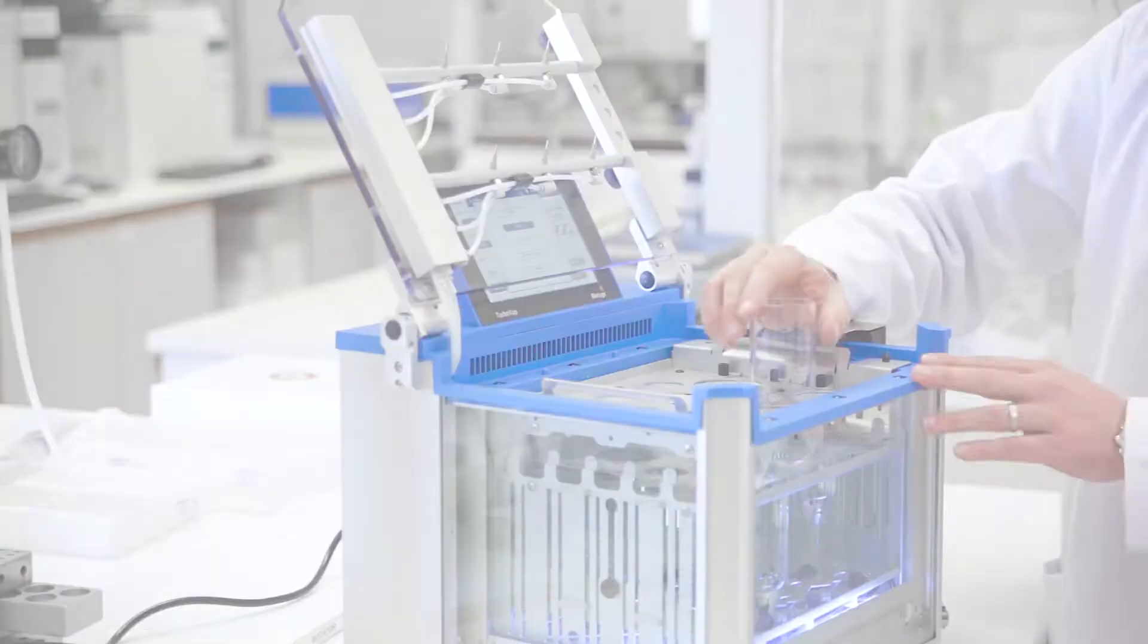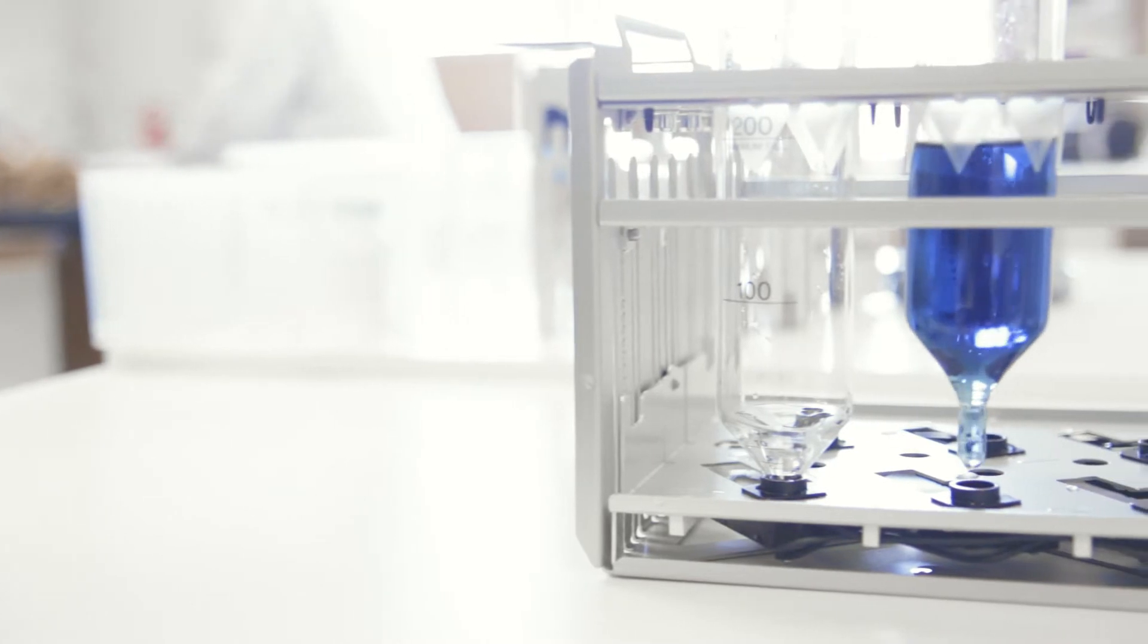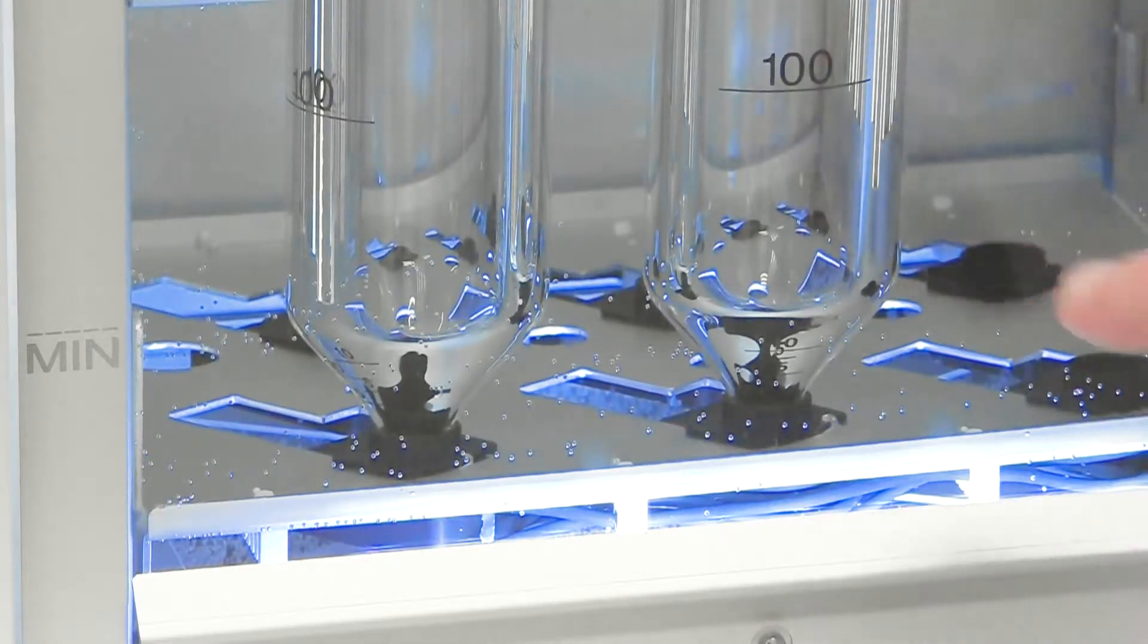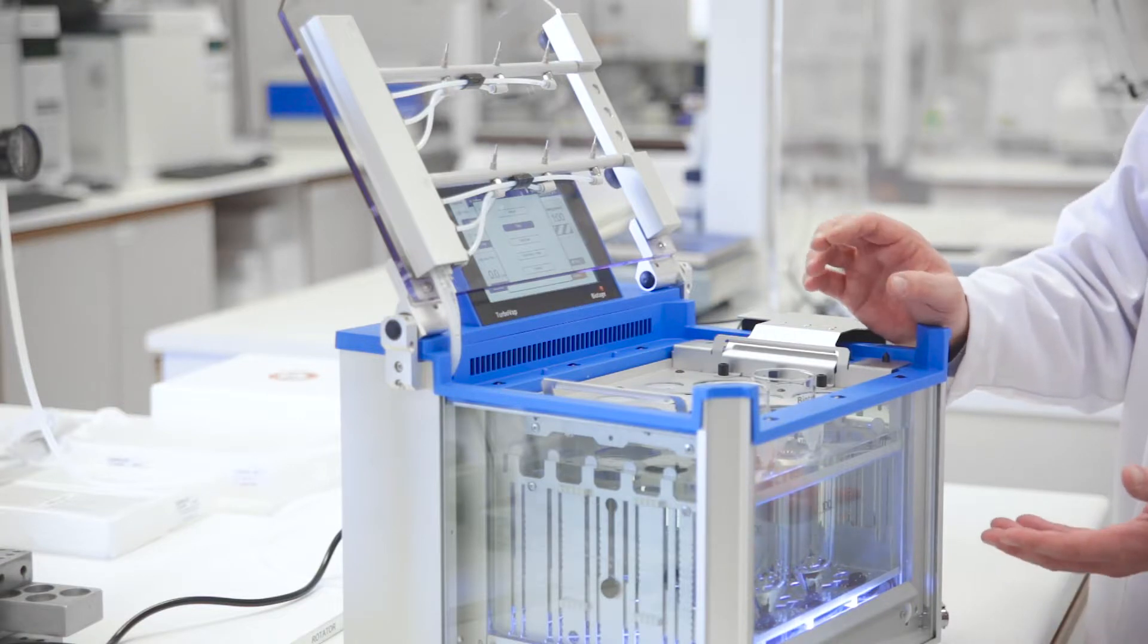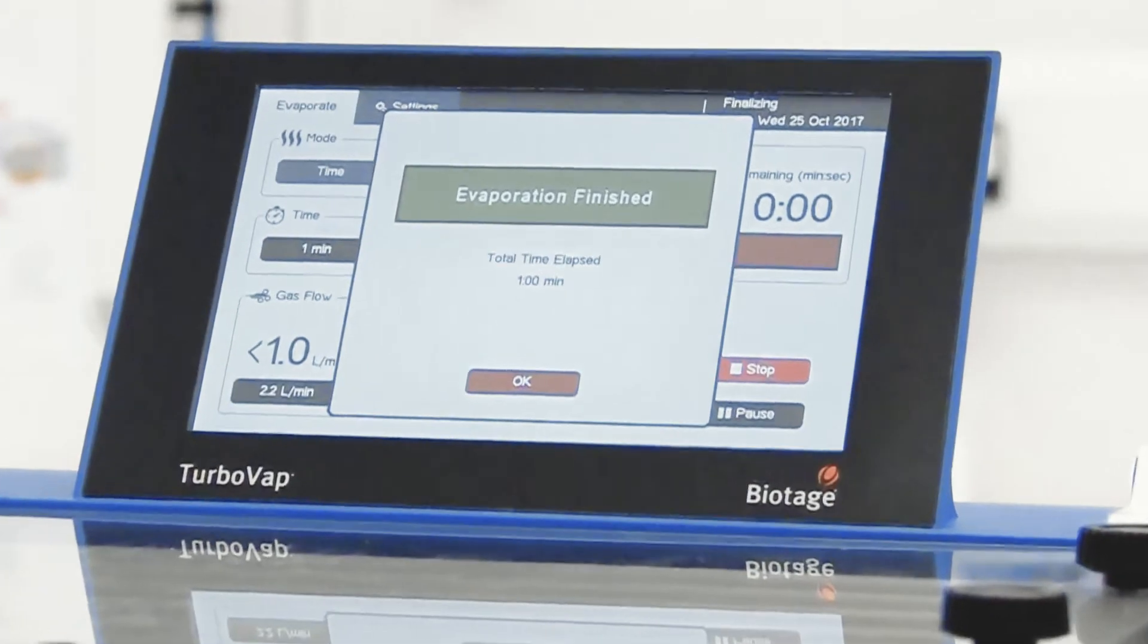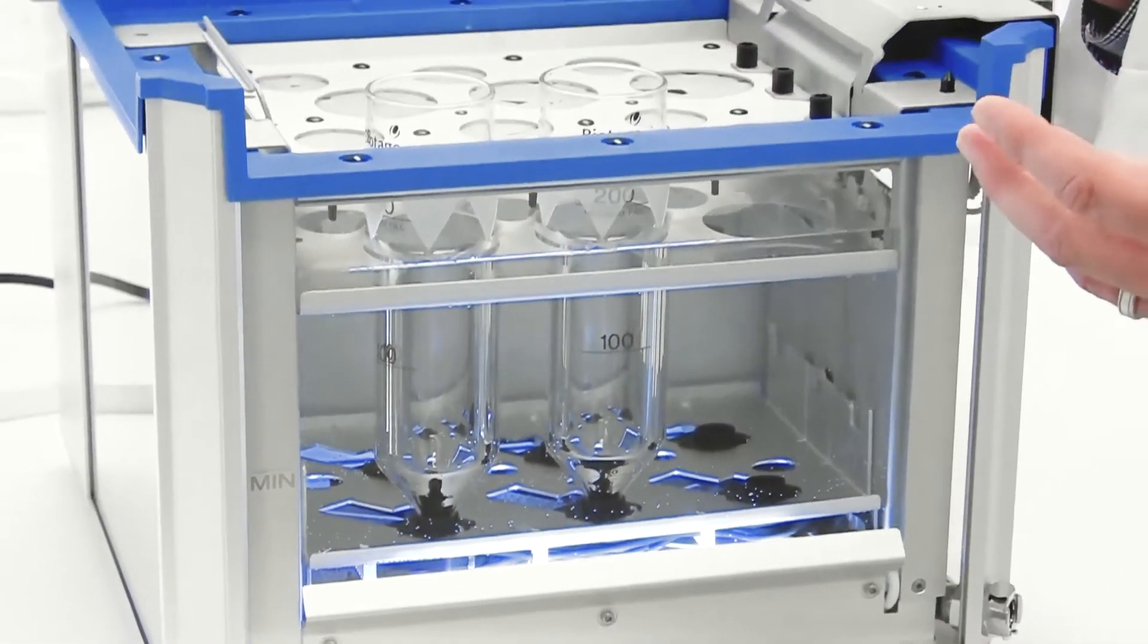What happens during the evaporative process as the solvent level moves down? We've got optical sensors in this rack which detect the solvent level as it approaches these 1 mil and 0.5 mil cutoffs, and the system will automatically stop the evaporative process once it reaches these volumes to prevent losses of some of your more volatile analytes.